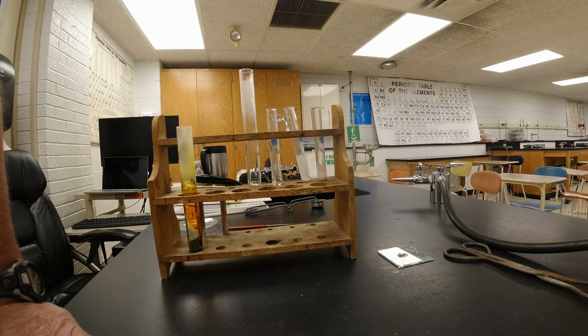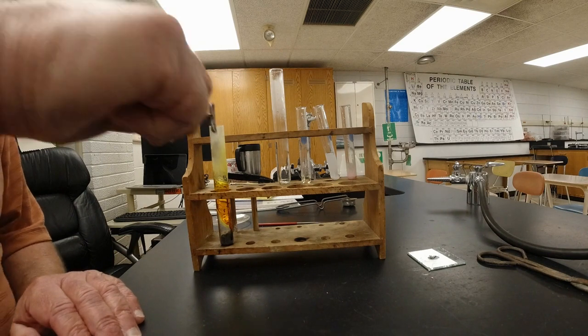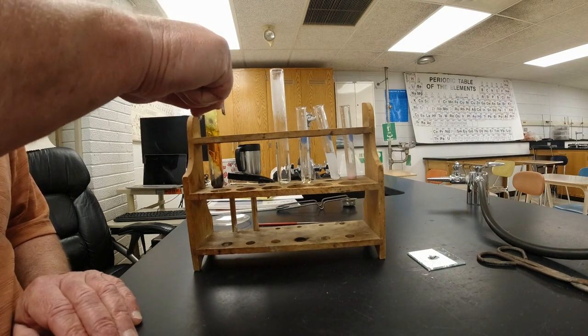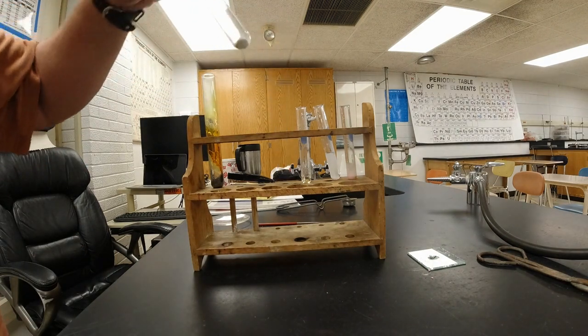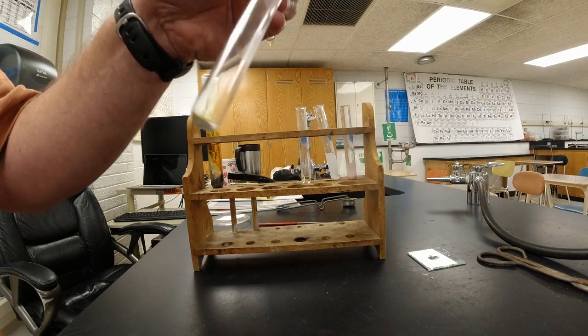Now, that test tube needs to cool off a little bit before we do anything more with it. As a matter of fact, it's pretty hot. It scorched the wooden thing on here a little bit, so I'm going to move it up there. Let's go back and look at our copper sulfate. These were those blue crystals, and you can see that it's white in color.